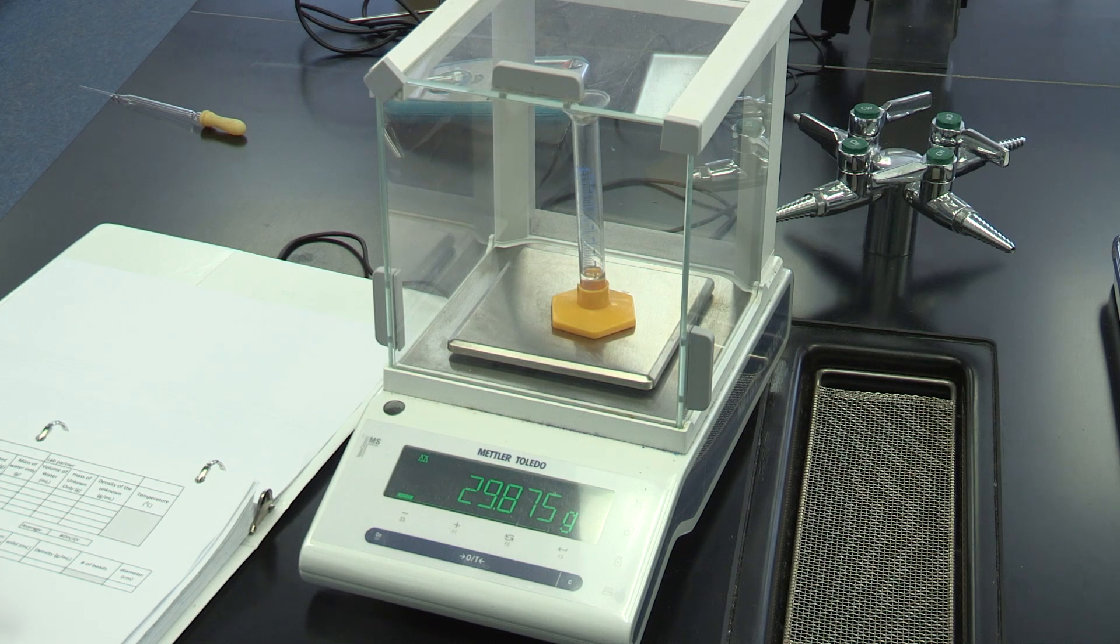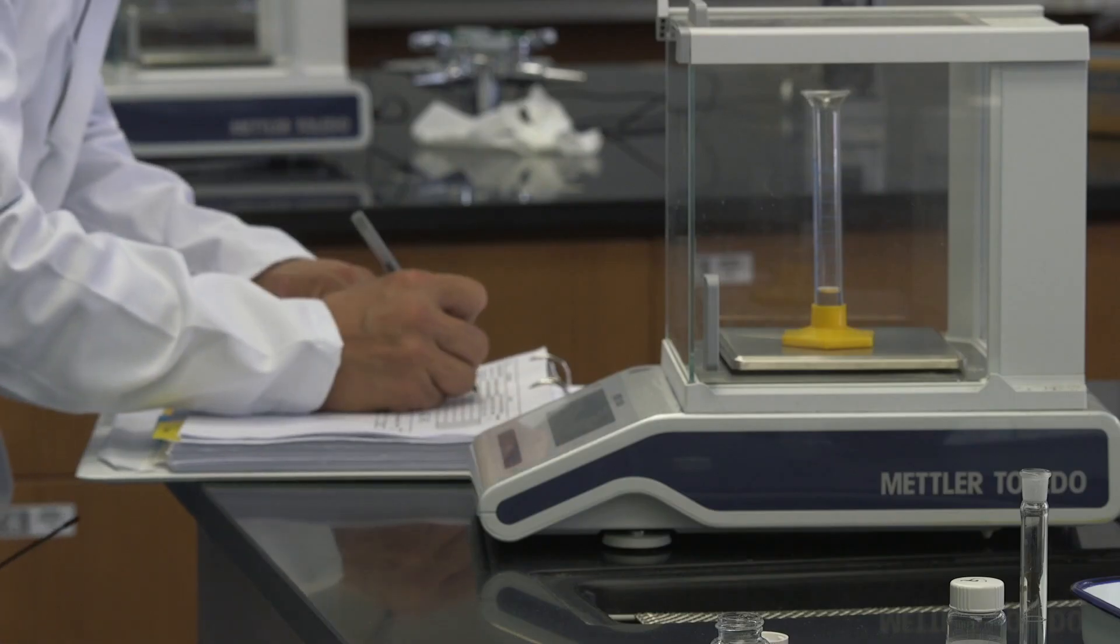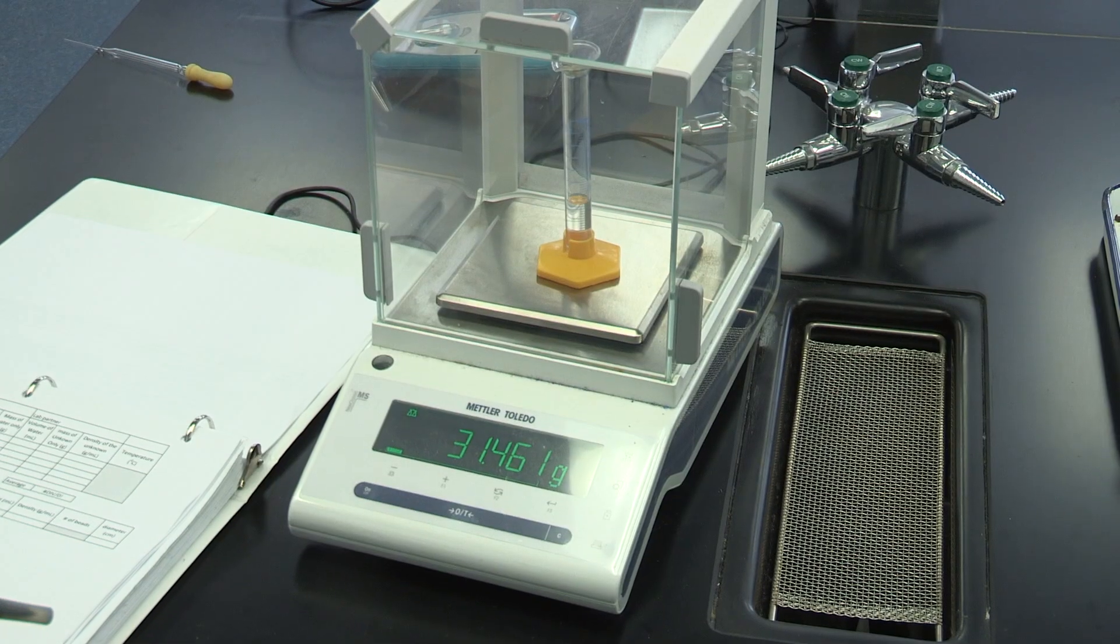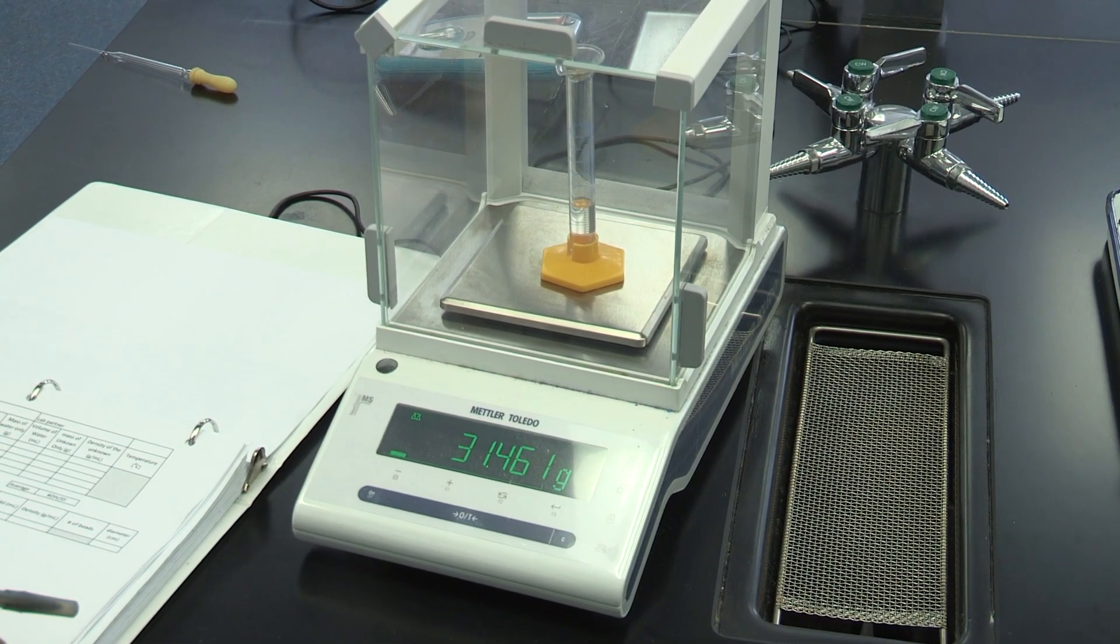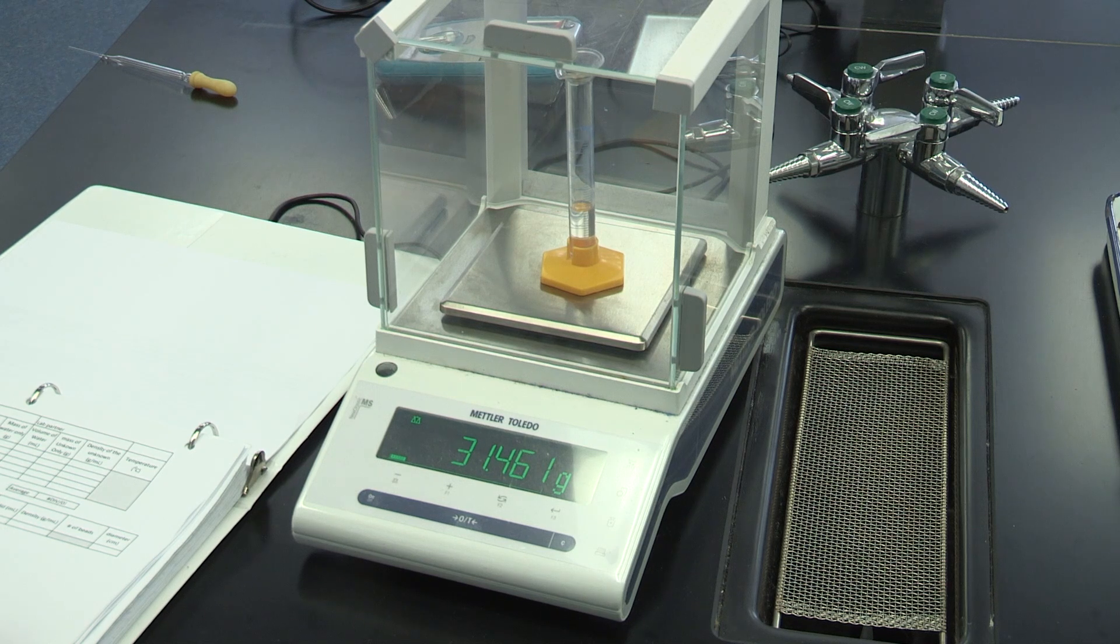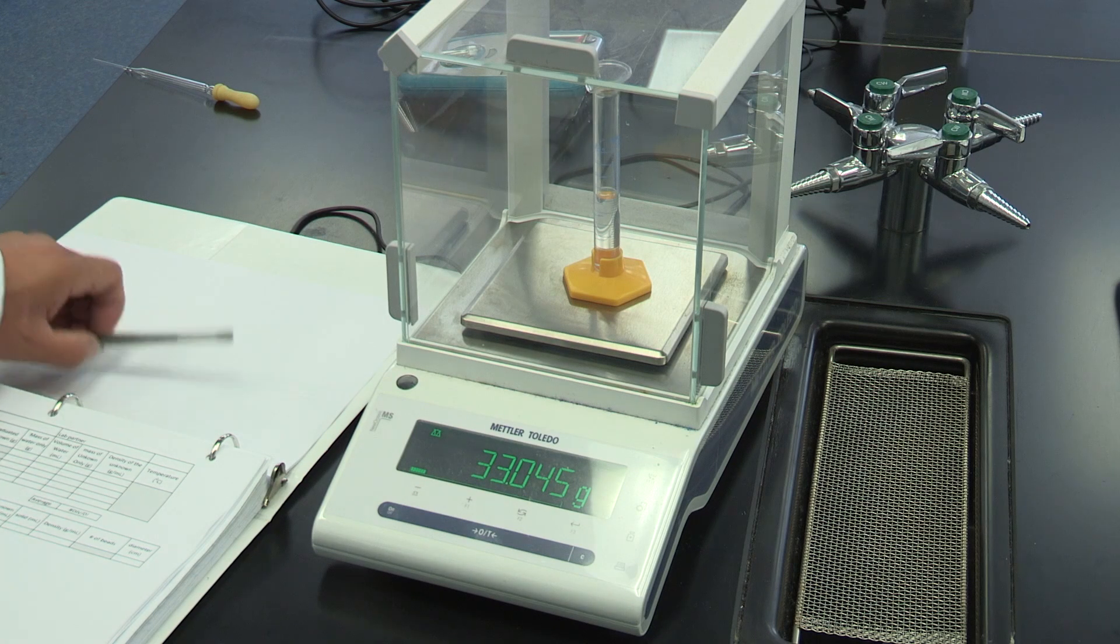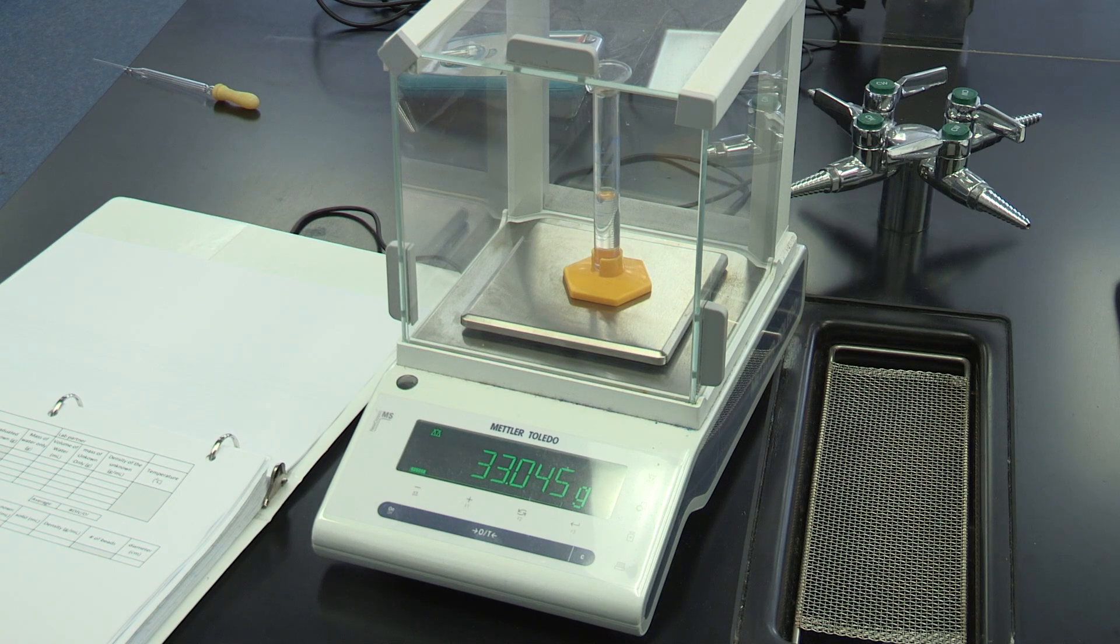With unknown liquid at 2 milliliter mark, the mass is 29.875 grams. With unknown liquid at 6 milliliter mark, the mass is 33.045 grams.